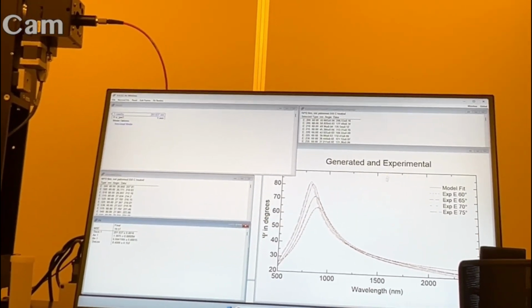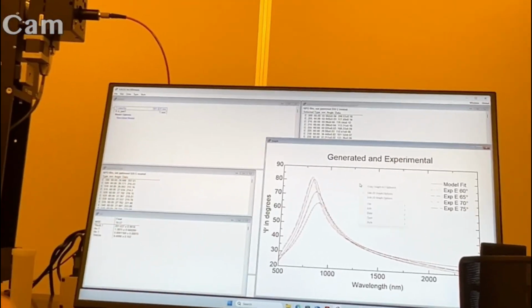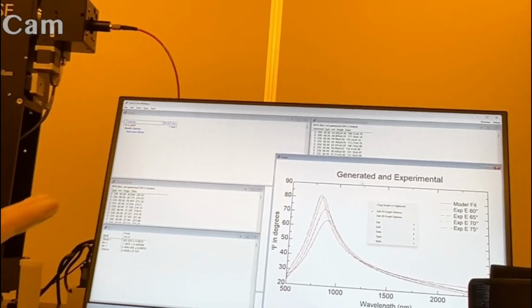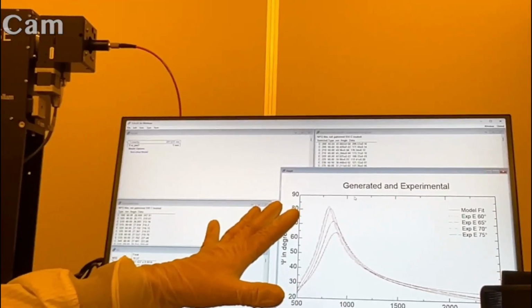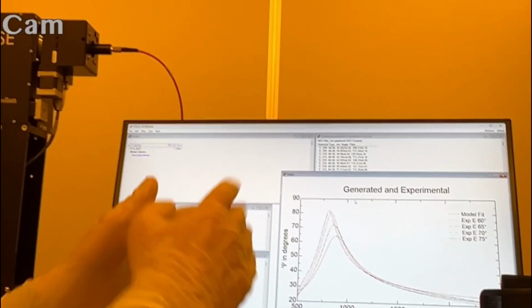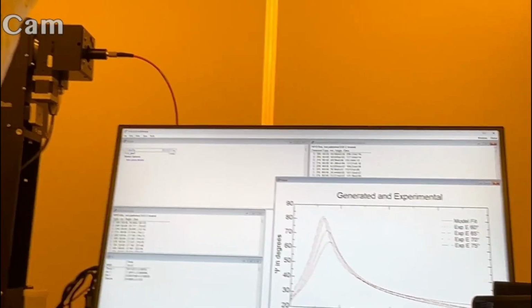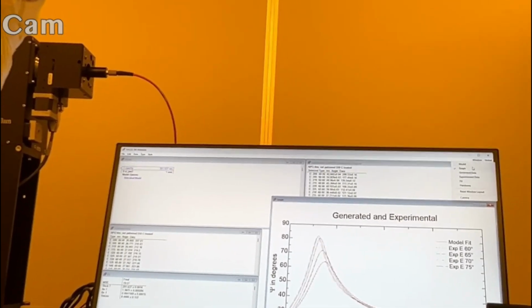And so if I want to test something else, we can either expand the range or do some other testing here. But especially if I'm going to just try some stuff, and I like where I'm at now, if I goof it up, I don't really want to start all the way from scratch. I want to save this model. So this is where I would normally save myself. I save environments. If I go to this global menu, I can say save current environment.